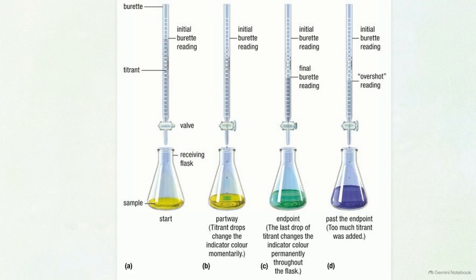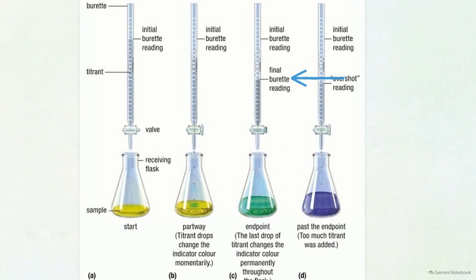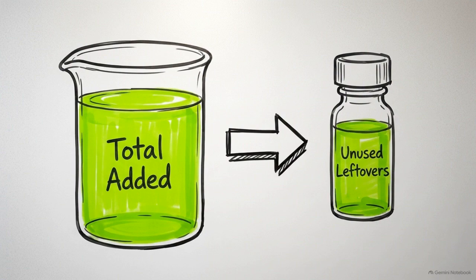Step 2 of the lab process takes us back to the burette. We take that flask containing the leftovers of reagent B and titrate it with a third standard solution, titrant C. We add titrant C until we hit the endpoint. This precise color change reveals the exact volume of titrant C needed to neutralize the remaining unreacted reagent B. Notice that this second titration does not measure our analyte directly. It is exclusively a way to measure exactly how much of our chemical flood went unused.